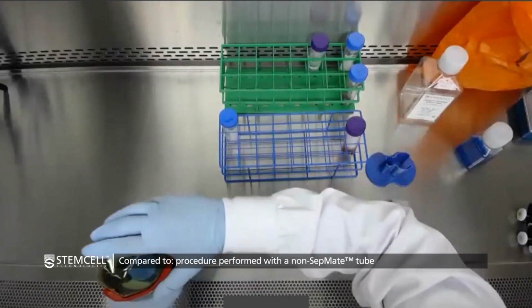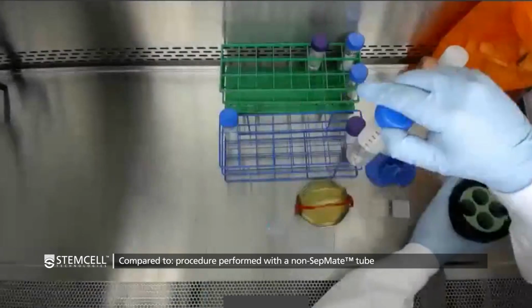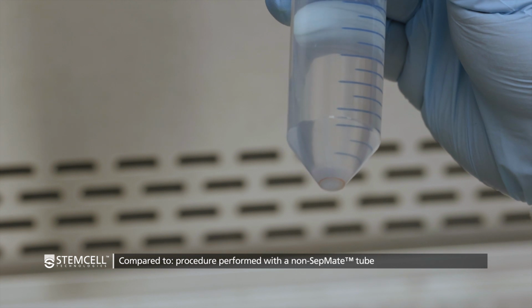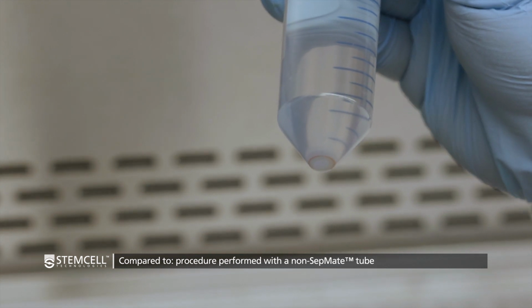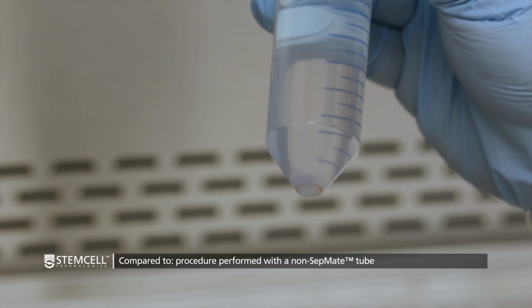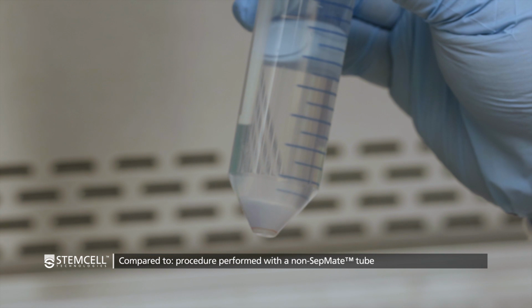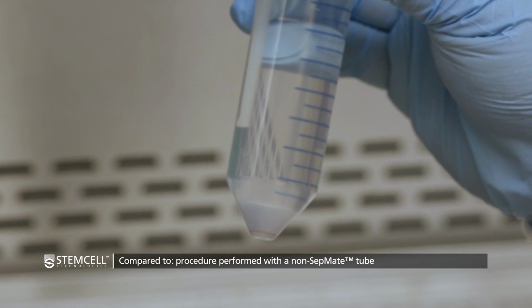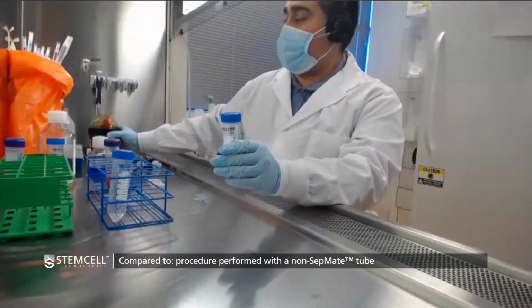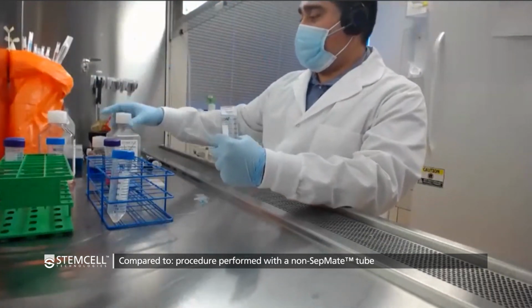Okay, so here we've taken our non-SepMate tube after the second spin, and you'll notice that very similar to the actual SepMate that we had done, there is some red blood cells among your white blood cells. So I suspect that once we've removed the supernatant and agitated the pellet, that it will again look a little bit orange, a little bit pink. As with before, you could do a pour off or you could aspirate off. It really depends on your comfort level. If you're going to be worried about recovery, then I would suggest doing a pipette off carefully. We're just going to decant because that's what most customers like to do.